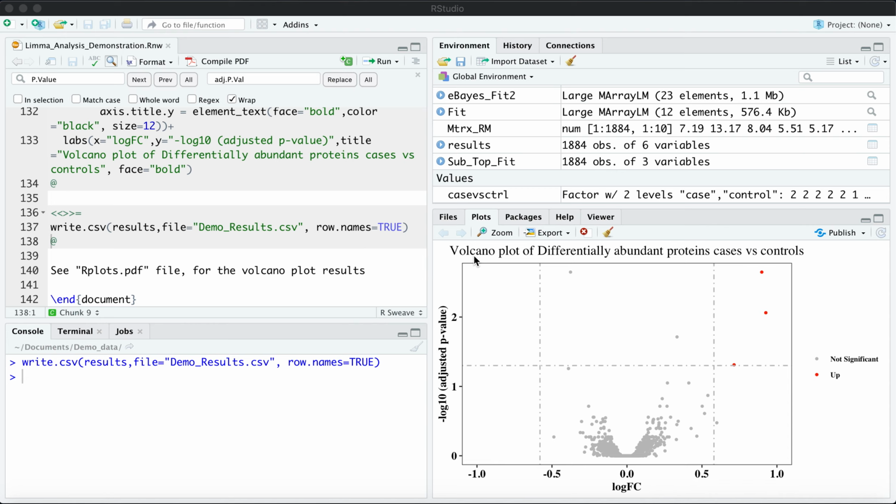Welcome back. So, in the previous video, we showed you how to perform a statistical analysis using limma and how to visualize the results. But now, how can I analyze this further?